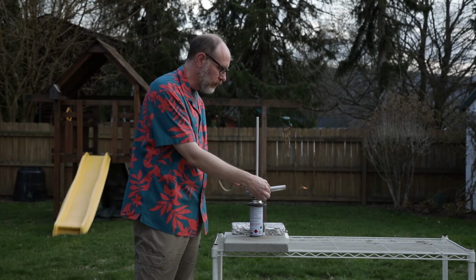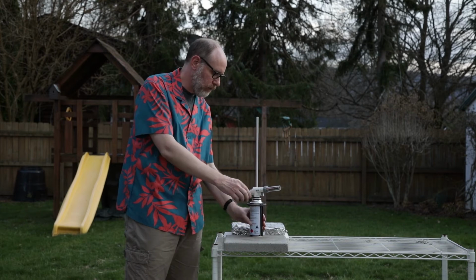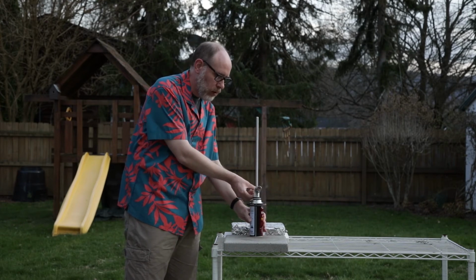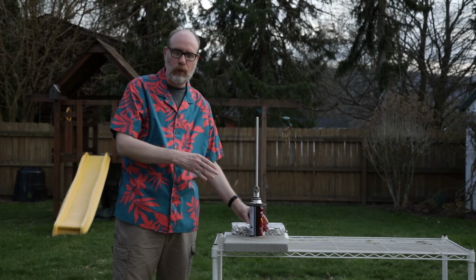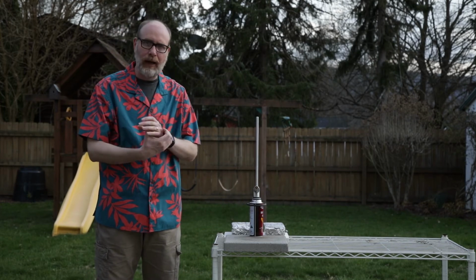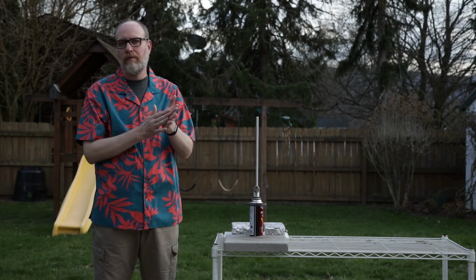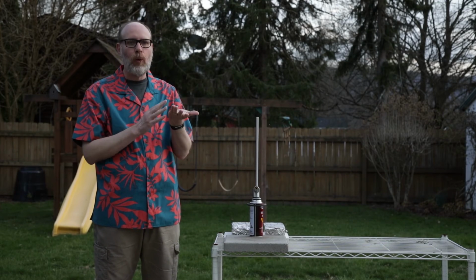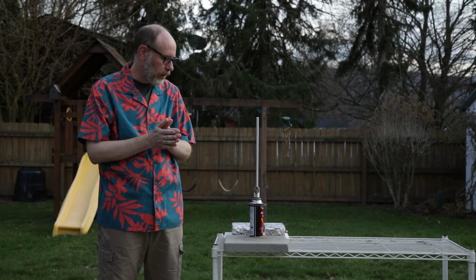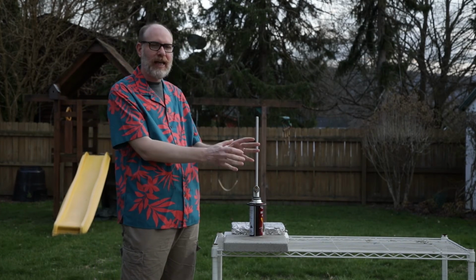And so those are the different types of flames. And what we're going to do in this particular demonstration is we are going to take this flame. We're going to use a nice blue lean flame. Whenever it's dark, you should be able to see that. And I'm literally going to spray a flammable substance, methanol or isopropanol, with some metal ion that's been dissolved in it. It's going to strike or get to that ignition source.